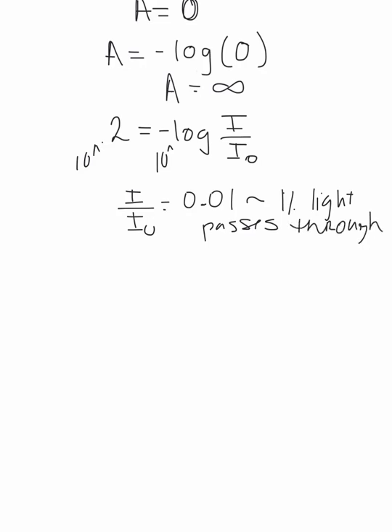And so most people would agree that an absorbance value greater than 2 is useless. And so many spectrophotometers won't even record an absorbance value much higher than 2.